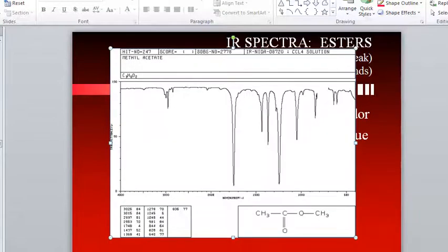I come up, and then there's 11, then there's 12, and then there's 13, and I come up. This is a very clean-cut molecule. I see one major band at around 1250, and then I see another major band around 1050. So this is an ester because there are two major peaks. But on a test or a quiz, I would have you label it as an ester slash ketone. It could be one or the other.